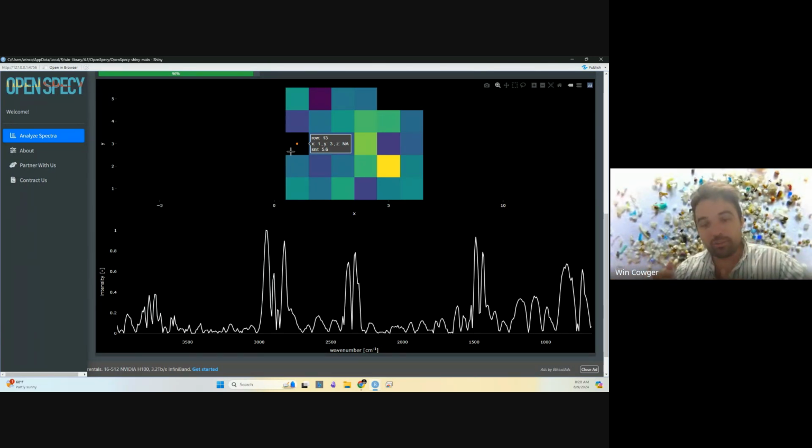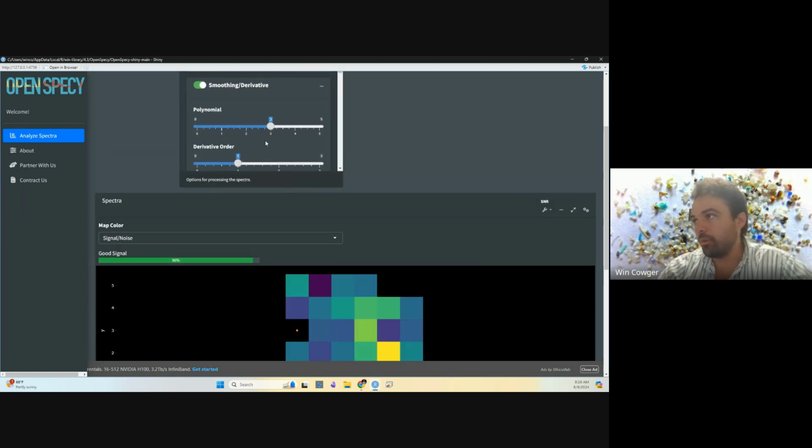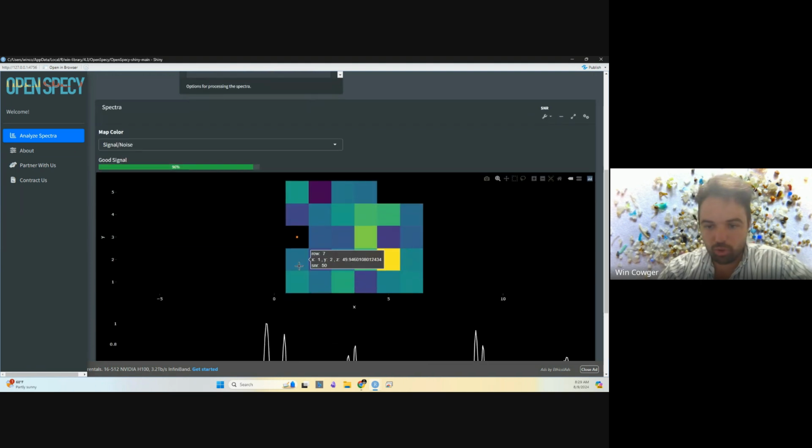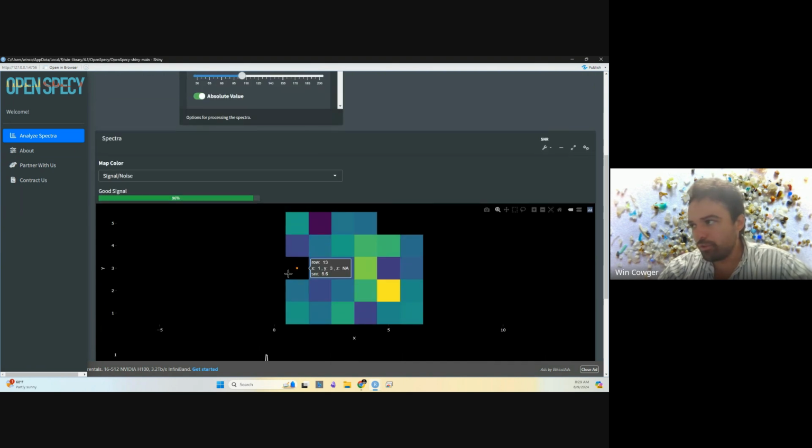And it's really good to set rules and say, all right, if I'm not above this threshold, then maybe I say this spectrum is unknown. 1 out of 28, I don't know what it is. It's too high noise. I'm not going to trust it. So that might be one conclusion you come to. You play with the settings a little bit. Oh, okay, I was able to get one more of the spectra on board. The other one is still not increased enough. I'm going to ignore that one, or maybe you do some special processing just to that spectrum, but you don't worry about it for the batch analysis.